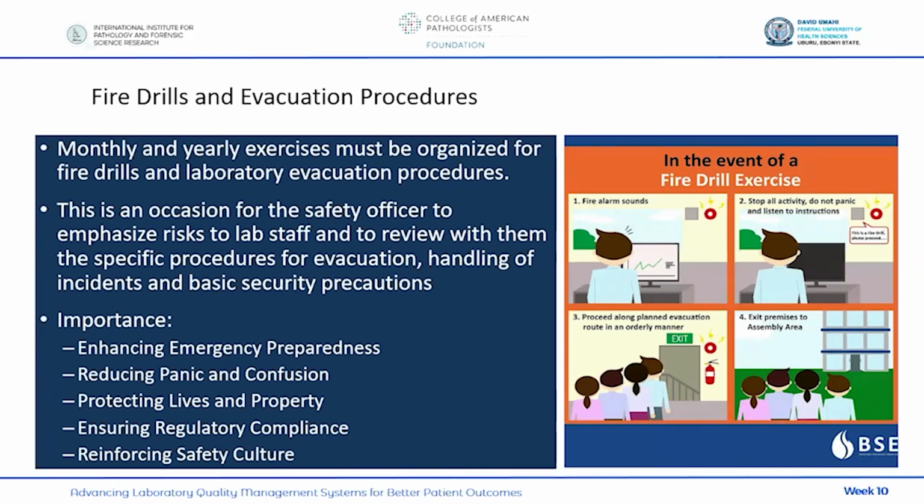We are still talking about safety in the laboratories, and fire drills are equally essential. It's an essential part of laboratory safety, and they must be organized at least once a year. That is the minimum that you should drill in your setting, okay, and evacuation procedures. So it's an occasion for the safety officer to emphasize risk to laboratory staff and to review with them the specific procedures for evacuation, for handling of incidents, and basic security precautions.